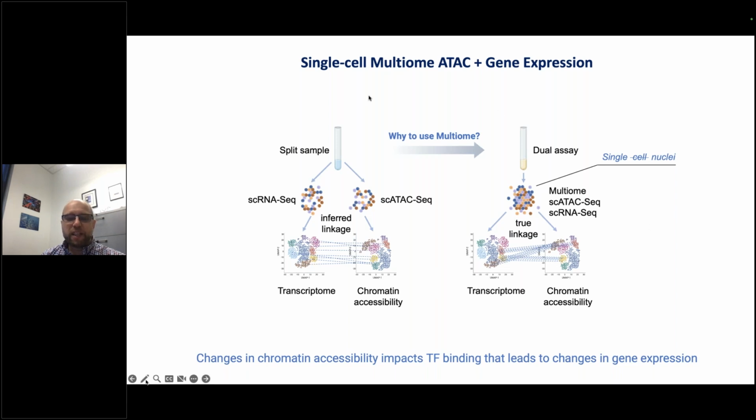Another important difference is that in single-cell RNA-Seq, you are looking at genes' mRNA that are present in the cells, and this includes both the nucleus and the cytoplasm. Whereas in multiome, you are looking just at the nuclei. And this makes responses to regulation much faster because there is much less influence of RNA stability on the level of RNA there.